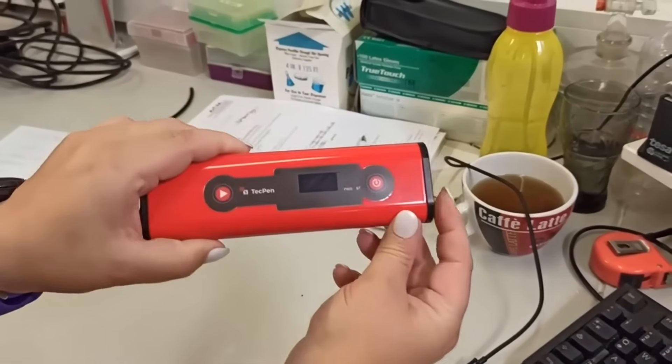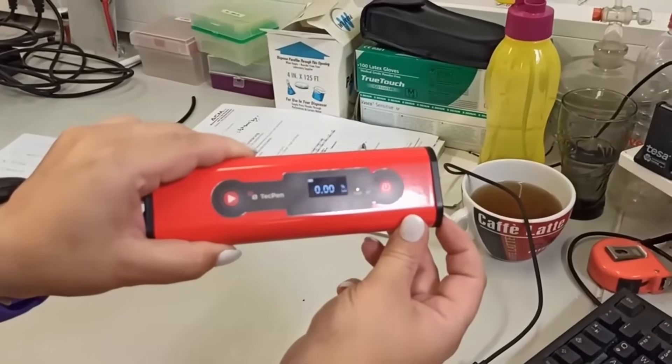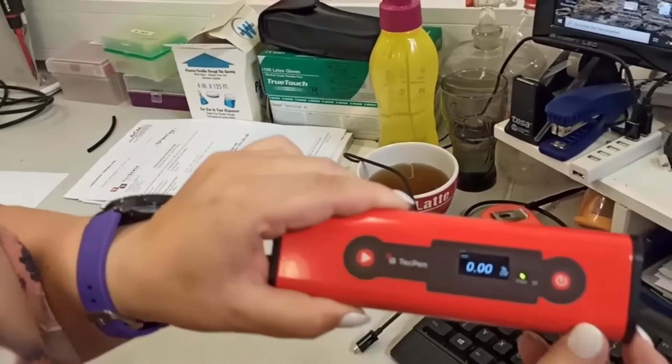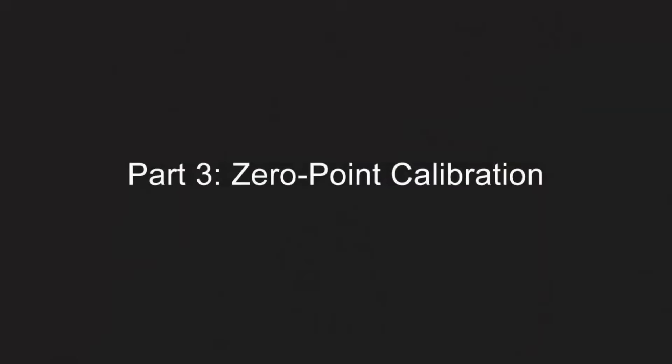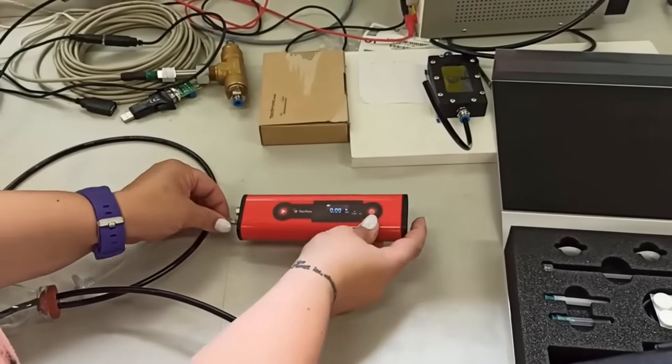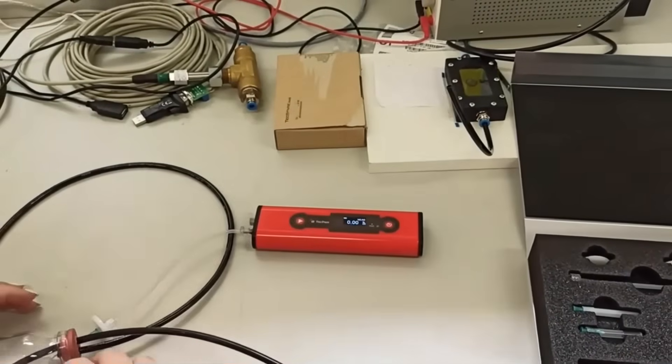Reboot the TechPen via switching off and on again. Thereby check the display — there should be the main screen without any information of a config value. Connect again your TechPen with the Nitrogen and perform measurements twice.